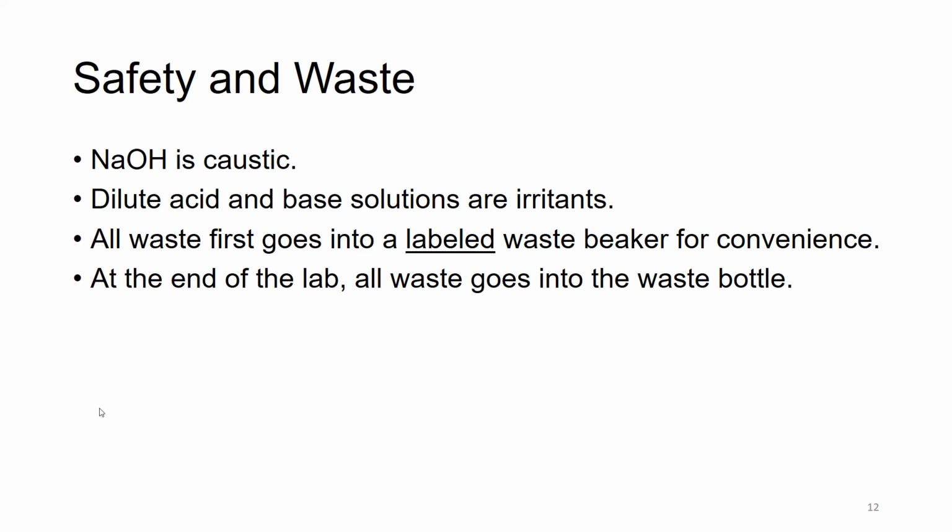Safety. Sodium hydroxide is caustic, so if there's any spill of sodium hydroxide on your skin, rinse for 15 minutes. And we'll have dilute acid and base solutions. They are irritants. And just for your convenience, during the lab period, always go into a labeled waste beaker. So you just put a label on it that says waste. At the end of the lab, you can dump all the waste into the waste bottle in one of the fume hoods.